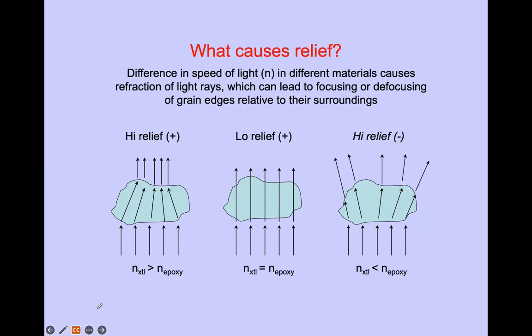In the middle example here, you can see the sample refractive index is the same as the epoxy, right?